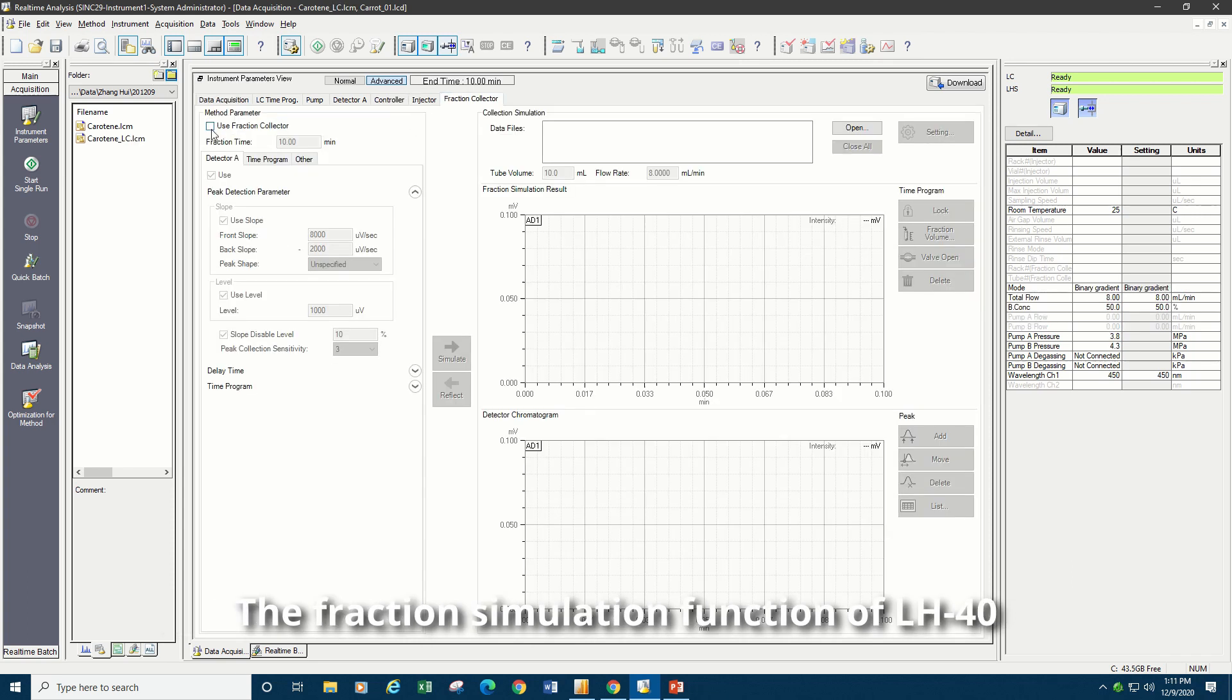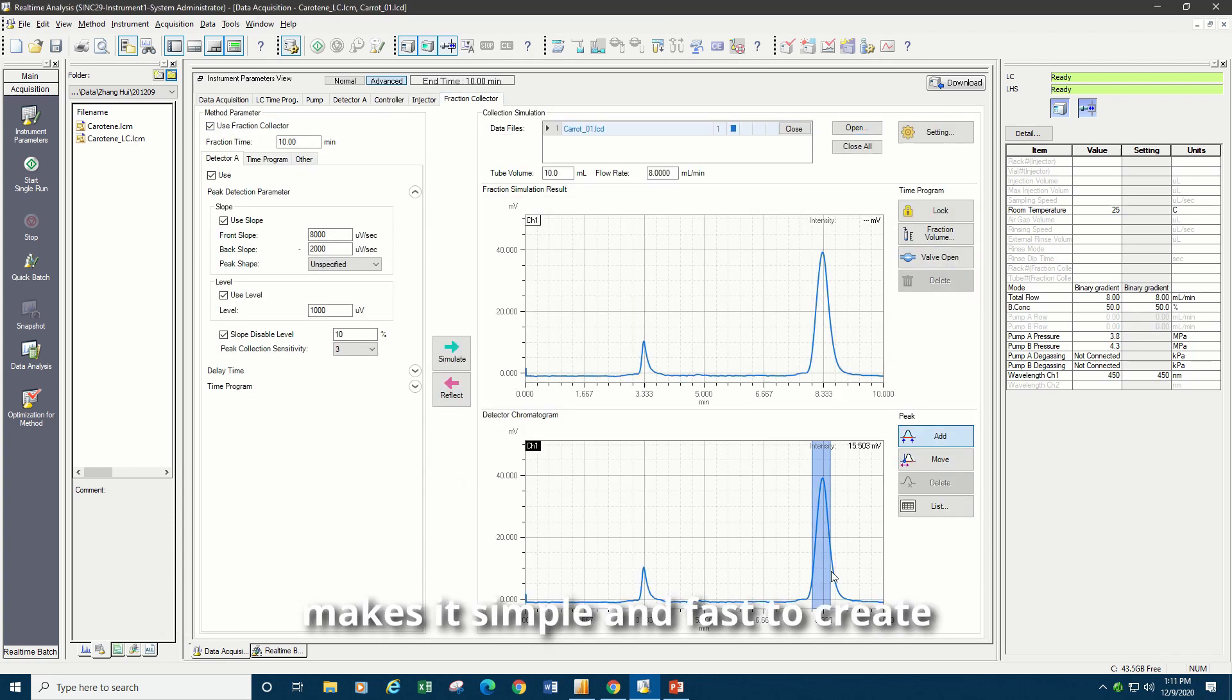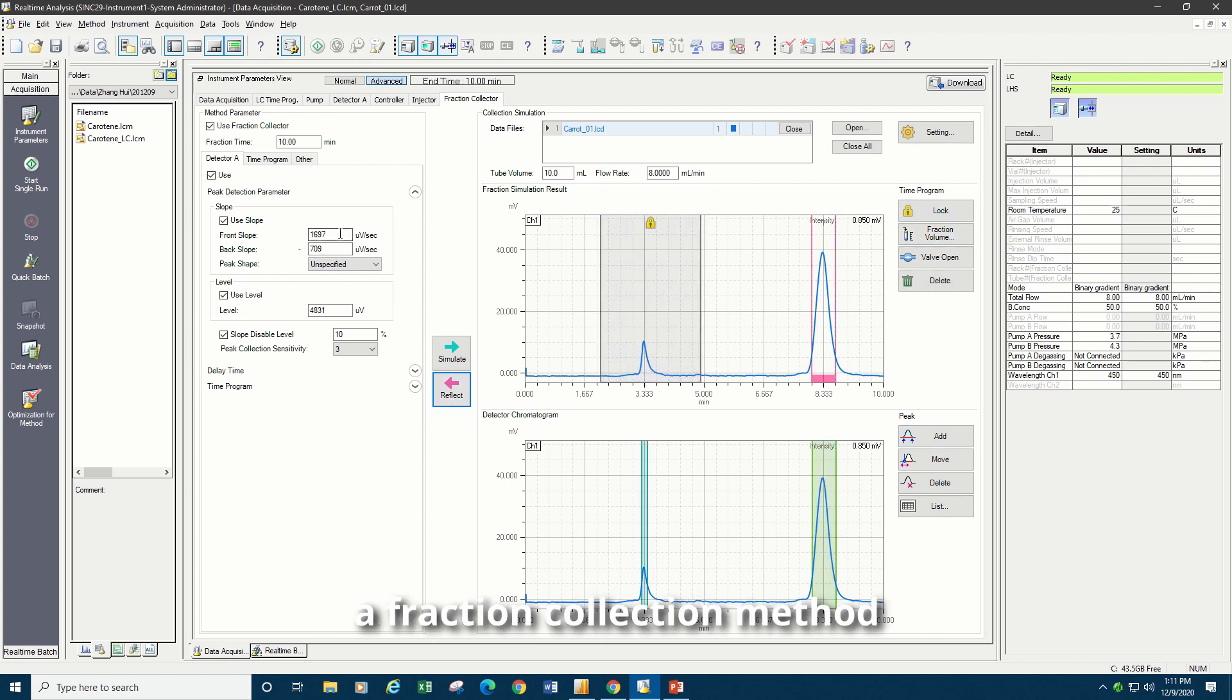The fraction simulation function of LH40 makes it simple and fast to create a fraction collection method.